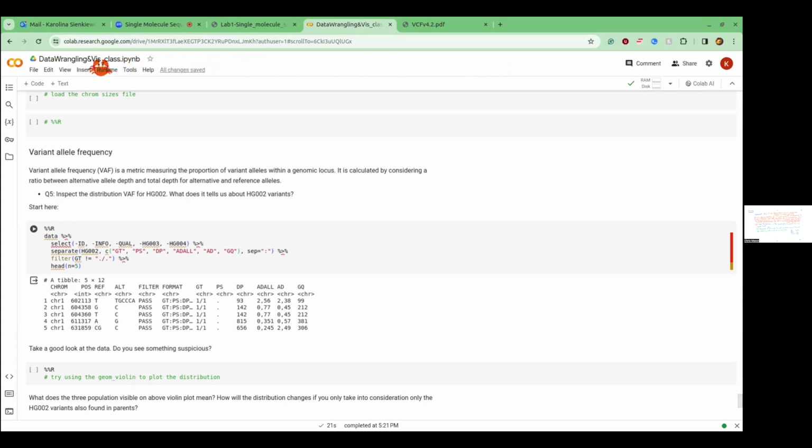If you're completely different than a reference because you're a homozygote alternative, then they will all be uninformative, right? Or if you have a completely different situation, like somatic mosaicism, with a bunch of different variants in your data, you will probably get a variant that is not that valid unless you specifically filter for low allele frequency. Somatic variants with low frequency are very hard to work with.